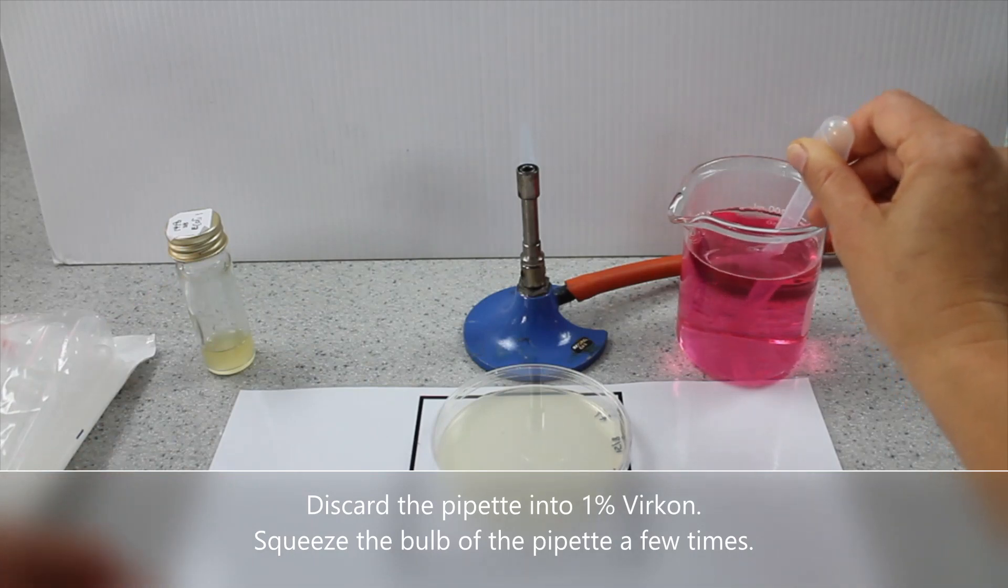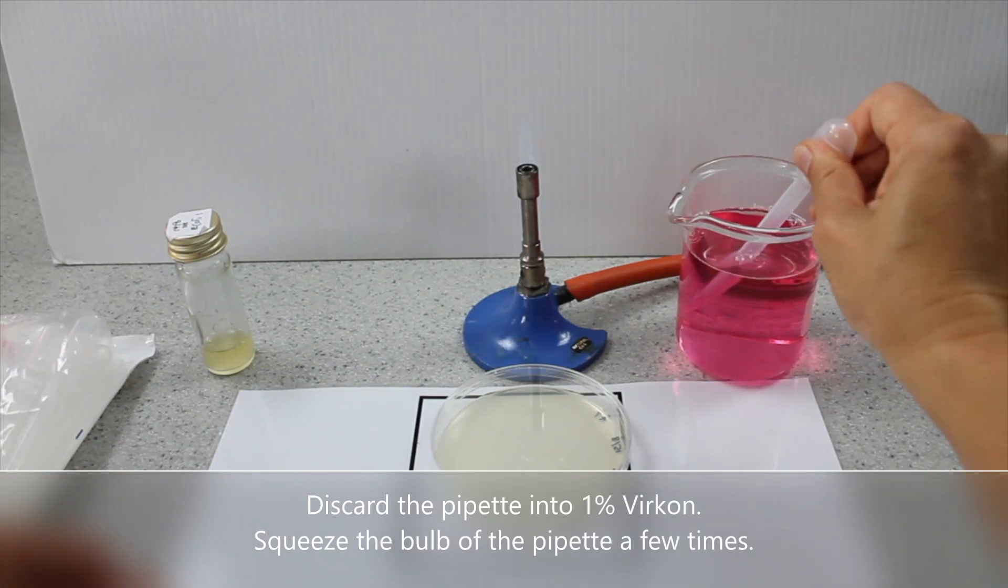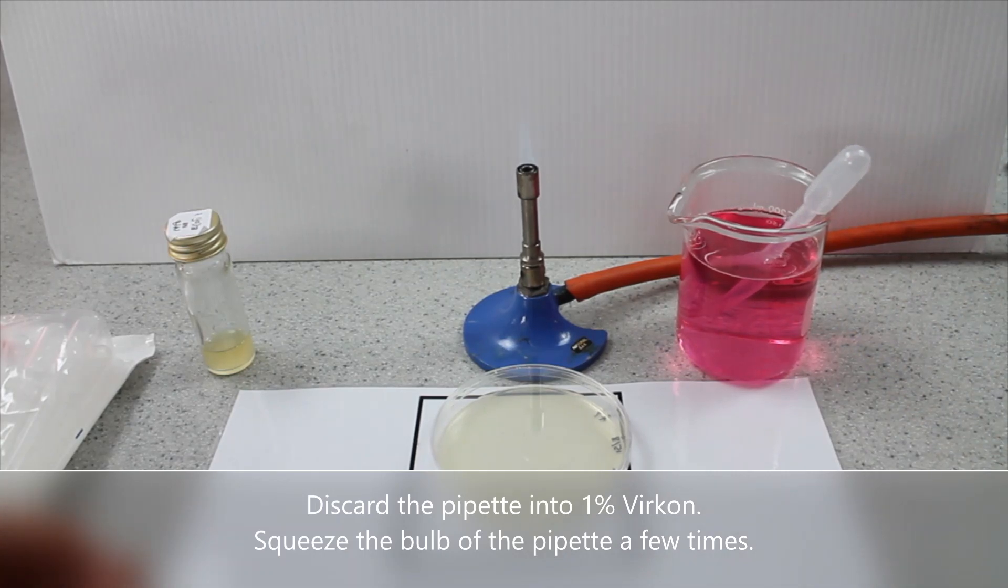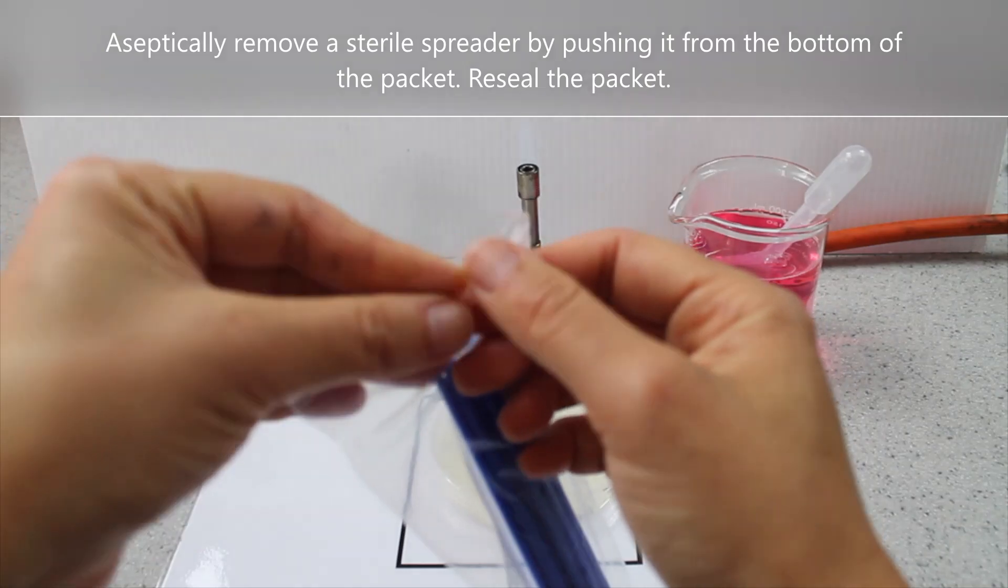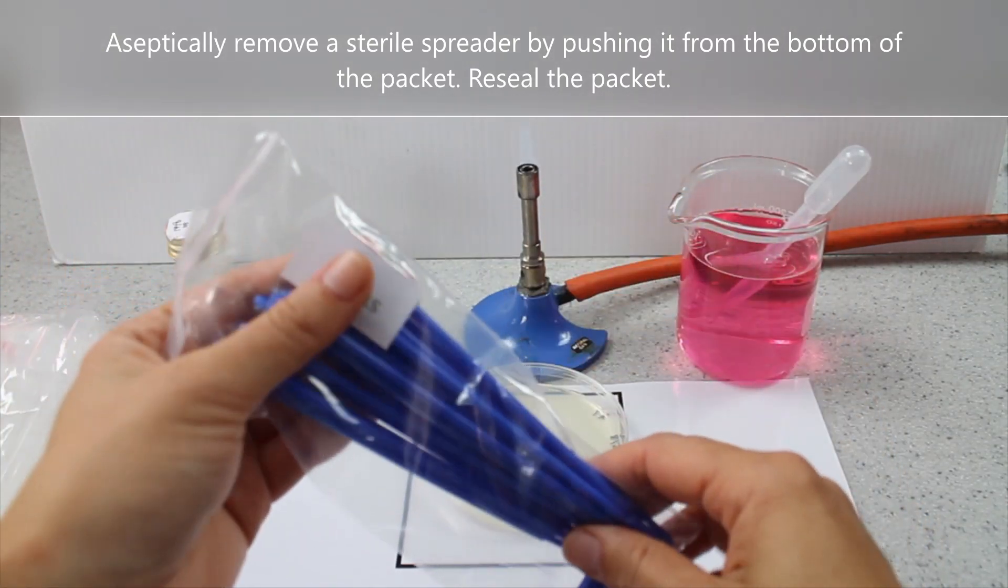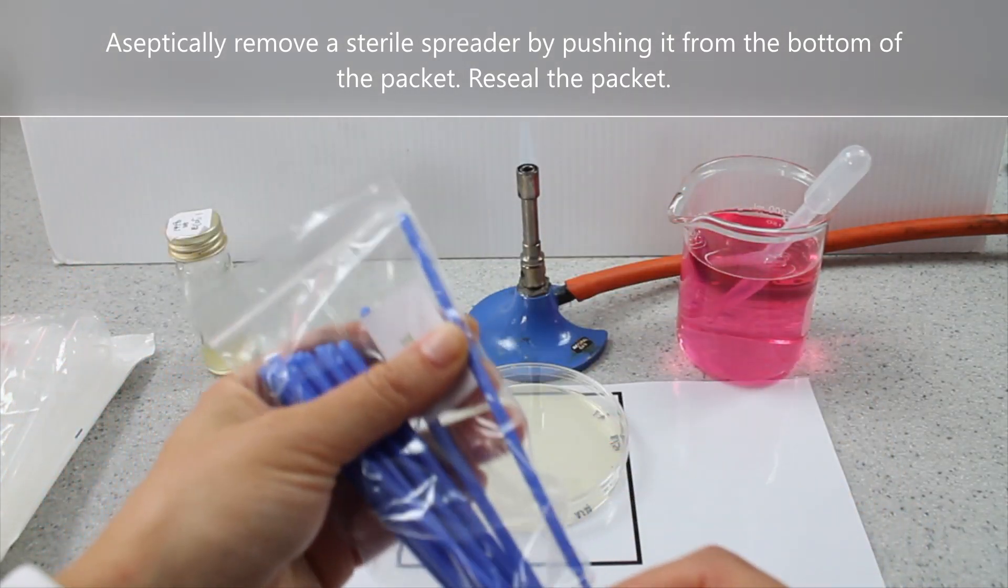Re-flame the lid. Discard the pipette into 1% vercon. Squeeze the bulb of the pipette a few times. Aseptically remove a sterile spreader by pushing it from the bottom of the packet. Re-seal the packet.